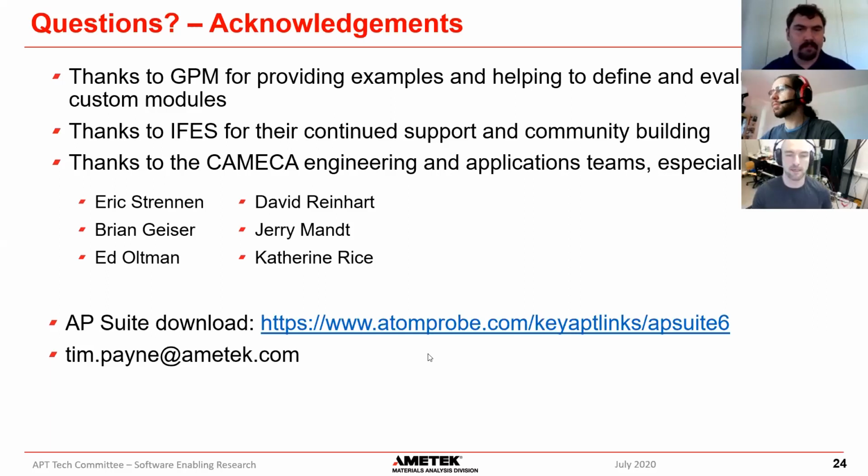We've got a question from Ben Kaplan. He says he can see that TOF and TOFB are on the APT file branches. Can you speak to the difference between those two? I guess he's trying to ask what the rawest form of data that you have available is.